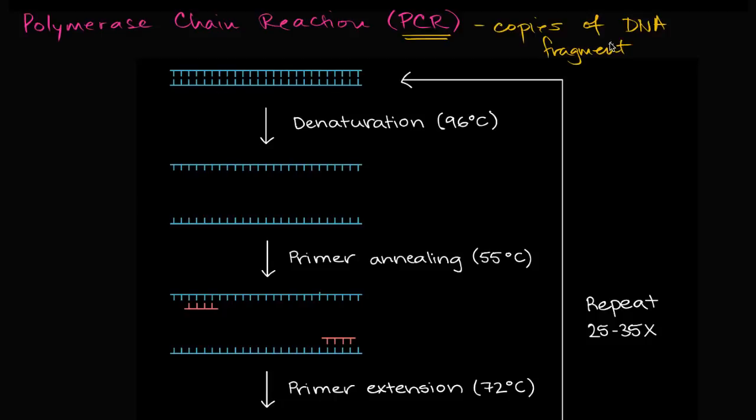Okay, so you've drawn some diagrams here, and I actually have never done PCR, but you have. So I'm going to tell you how I understand it happening, and then you tell me if this makes sense. What you drew over here is double-stranded DNA. This could have been from a sample of someone's hair or whatever else. And let's say we want to make many copies of a fragment of this. The fragment that we really care about is roughly from there to there. This part is what we want to make multiple copies of.